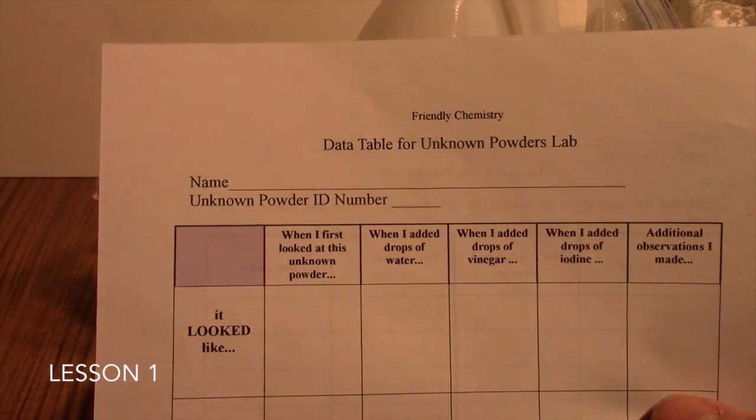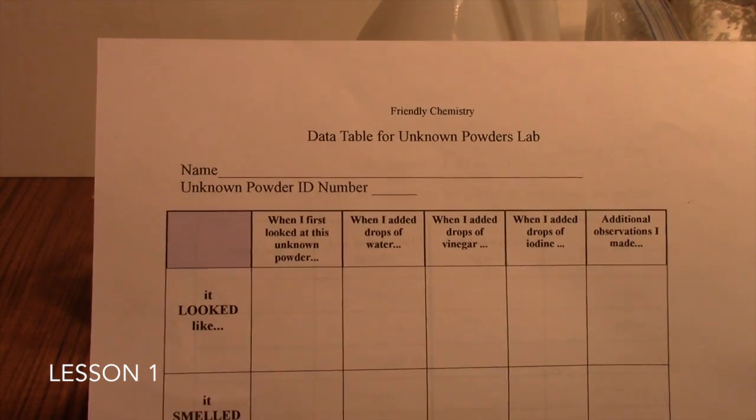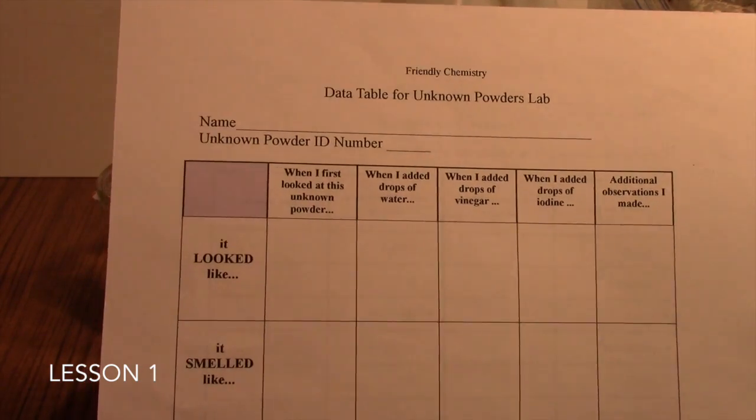Again, they should not know what these powders are. Now, some students may take a look and say, I know what that is, or I know what that is, but tell them just, we're making observations, and then we'll talk about identities later on.